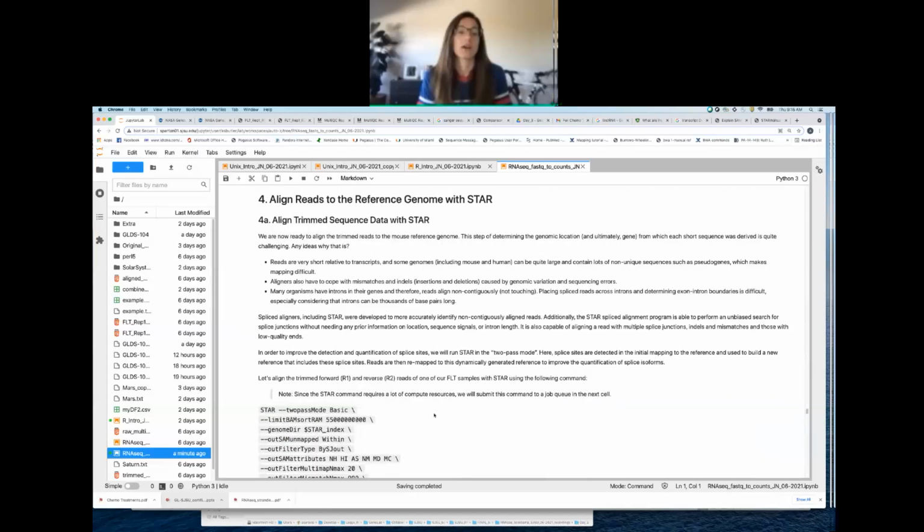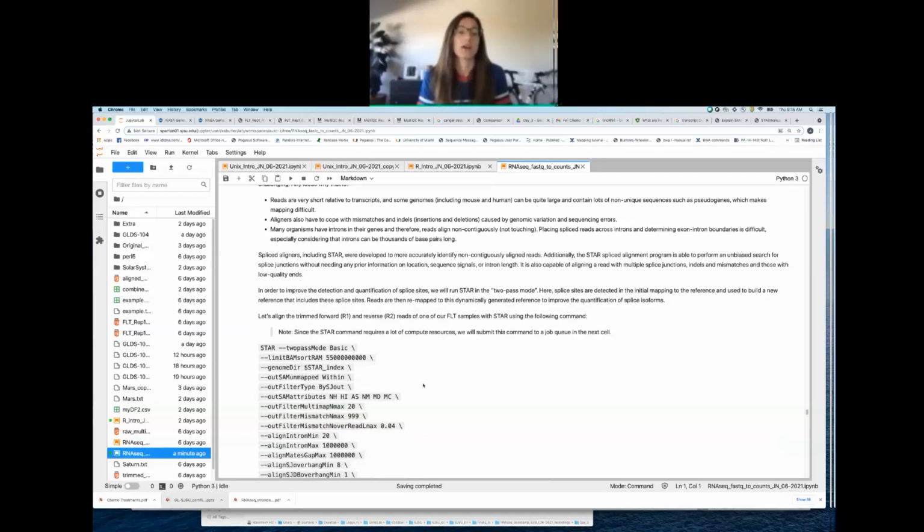Just to remind you all, this is at step 4A. You also could have gotten there by clicking on the index at the top of the notebook, the table of contents, that was what I was looking for.